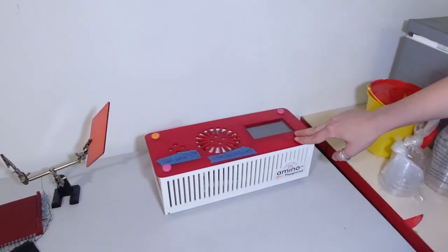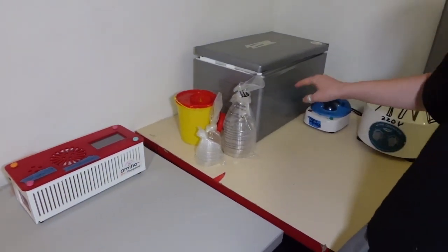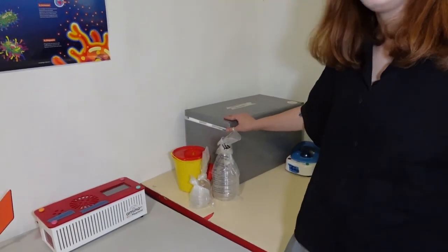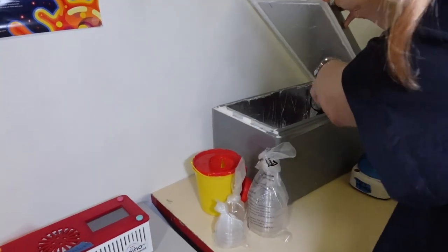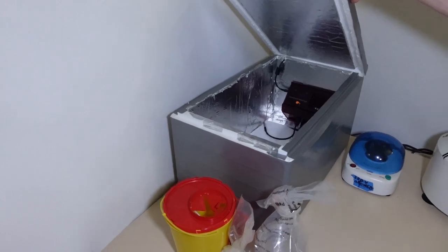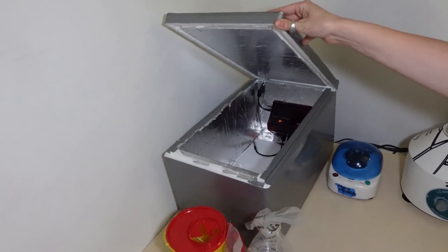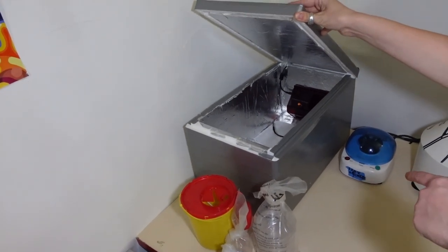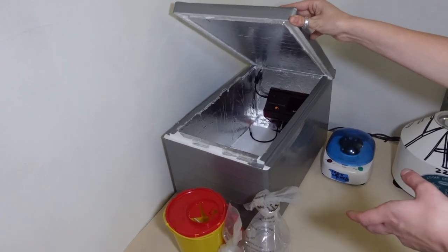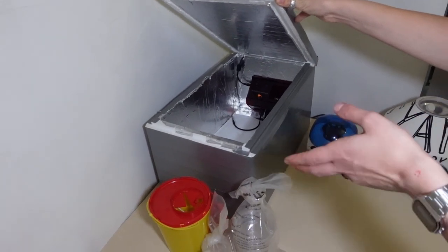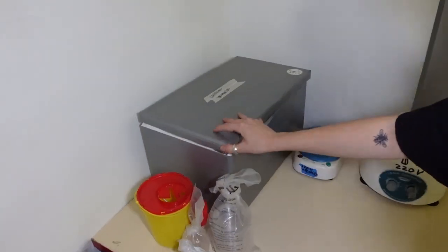Here I have a bacterial incubator, it's just a styrofoam box and I use some aluminum tape to keep the temperature. They're also from Manifest Biology, there's controls, it's a little thermostat. It's custom, you can use whatever box you want like a cooler to keep the temperature and it has a thermal sensor. This is where I mostly cultivate bacteria.